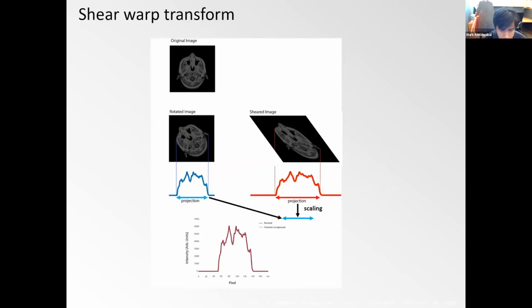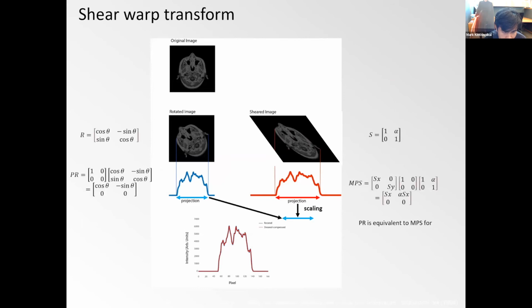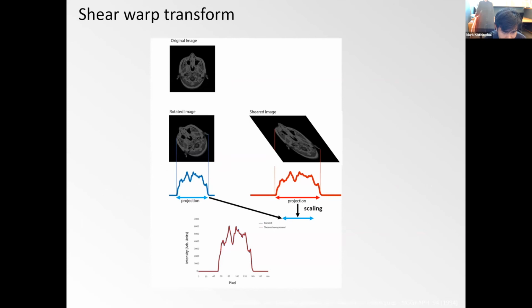And so what we found that could provide us with these projective views under different angles is the shear warp transform. We essentially rediscovered it in a way. We first thought that we accidentally stumbled on it, but we then found some papers. I hope I cited below. No, my apologies. On this slide, I do not, but it was essentially the same guy who invented the, what is it called? The light field microscope. He also has a paper on computer graphics using this, the so-called shear warp transform, to compute different views.